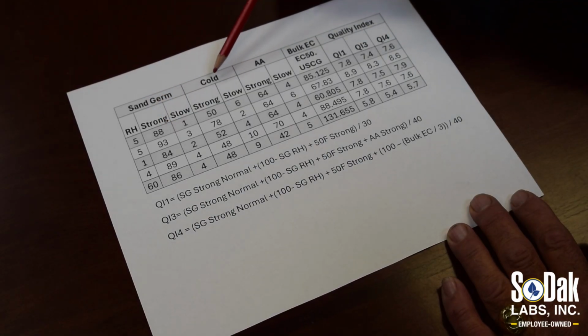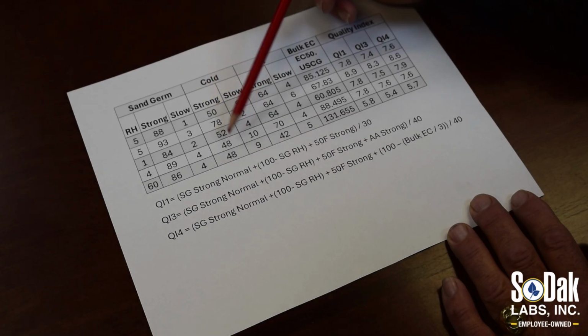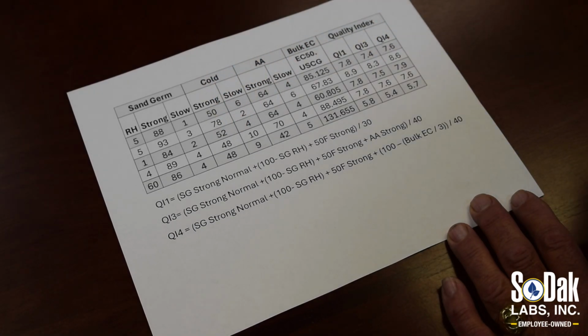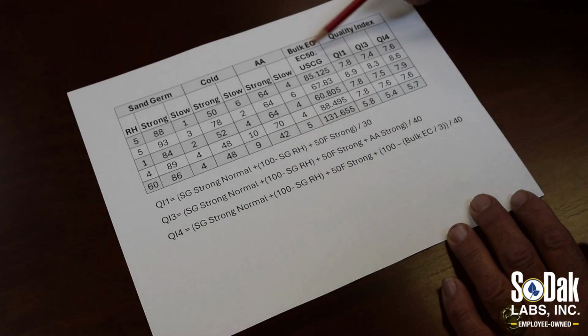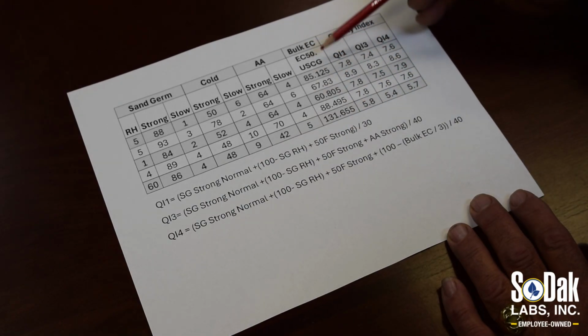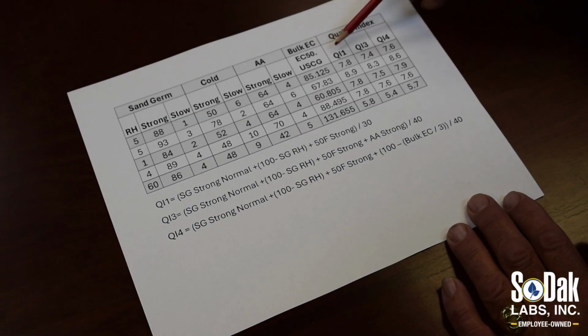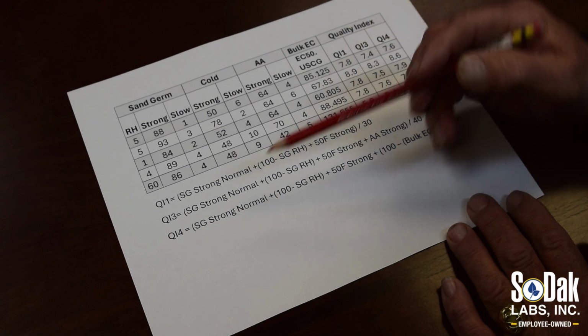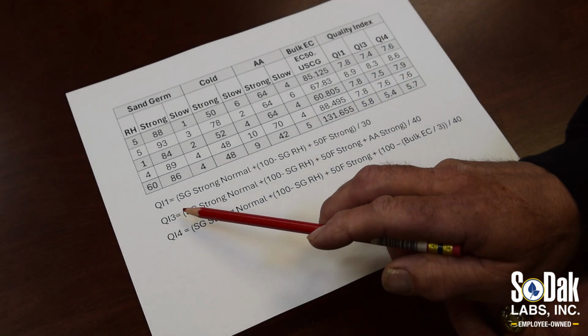In the 50 Fahrenheit cold, we look at the strong normals. AA, we look at strong normals. And then bulk EC, we look at the microsiemens per centimeter per gram. And then we have 3 examples of quality indexes here. And down here, you develop an equation.